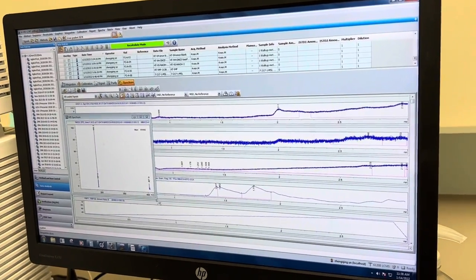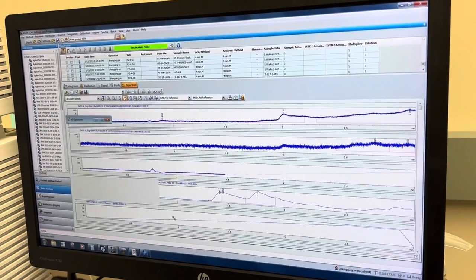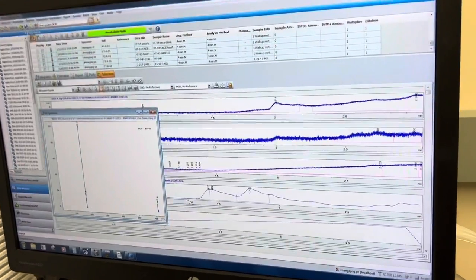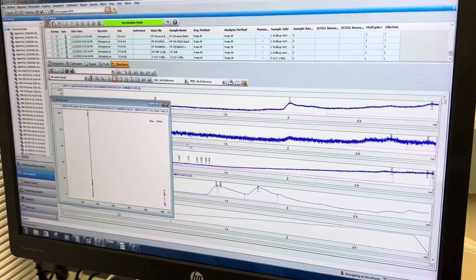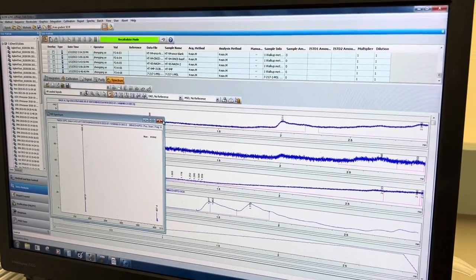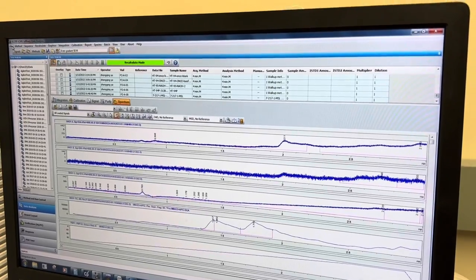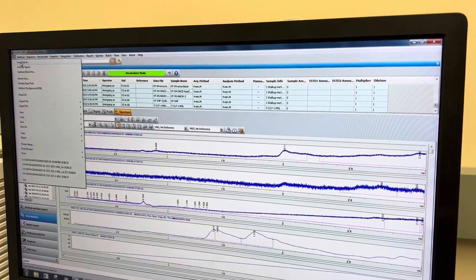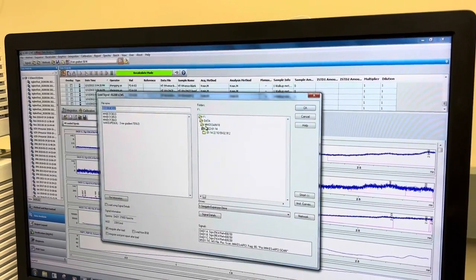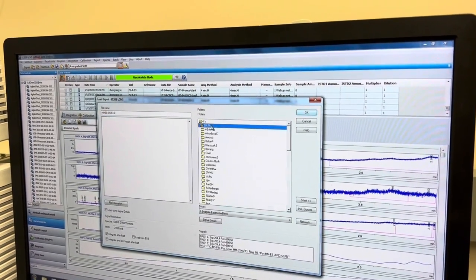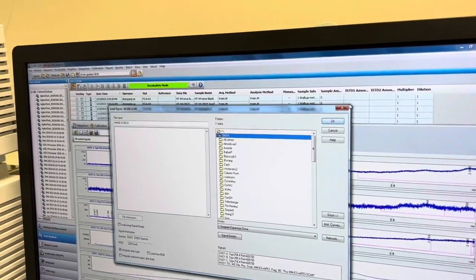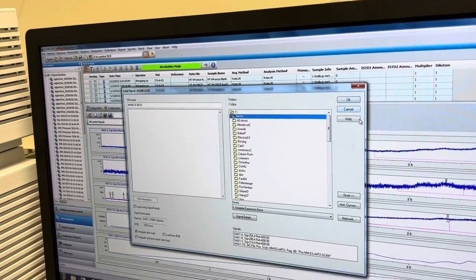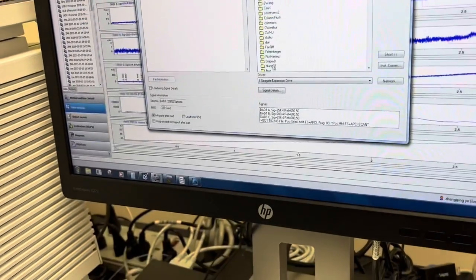How did you get onto this page again, what, how did you get to this page overall, this page? Okay, yeah, so file, load signal. Oh no, I mean before that, how did you open the software, like which, oh yeah, well did you have it open already?